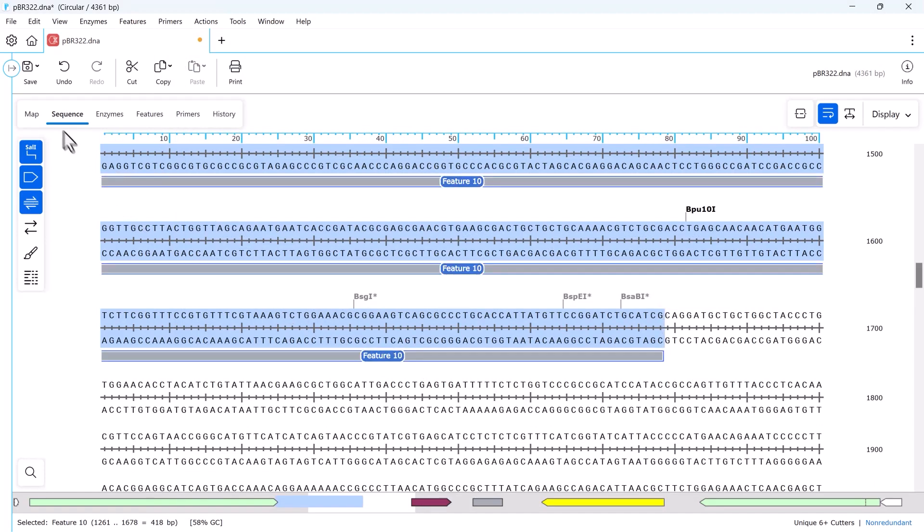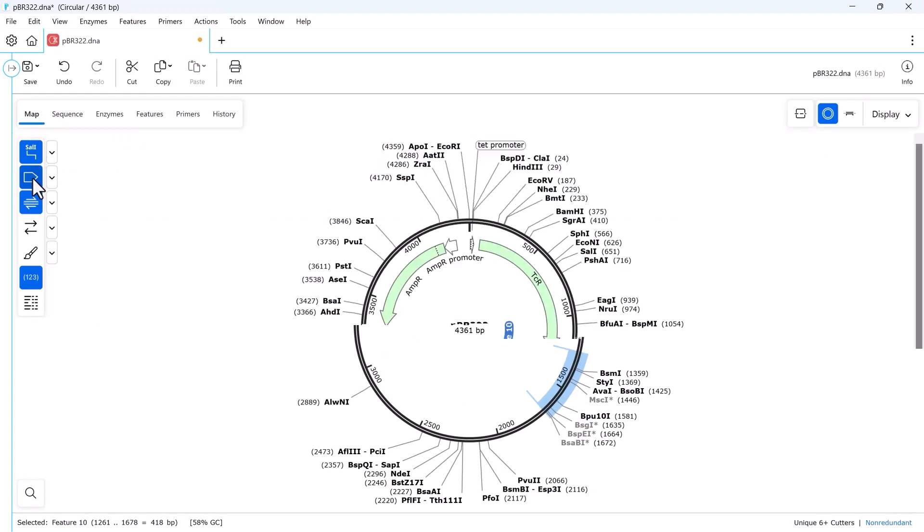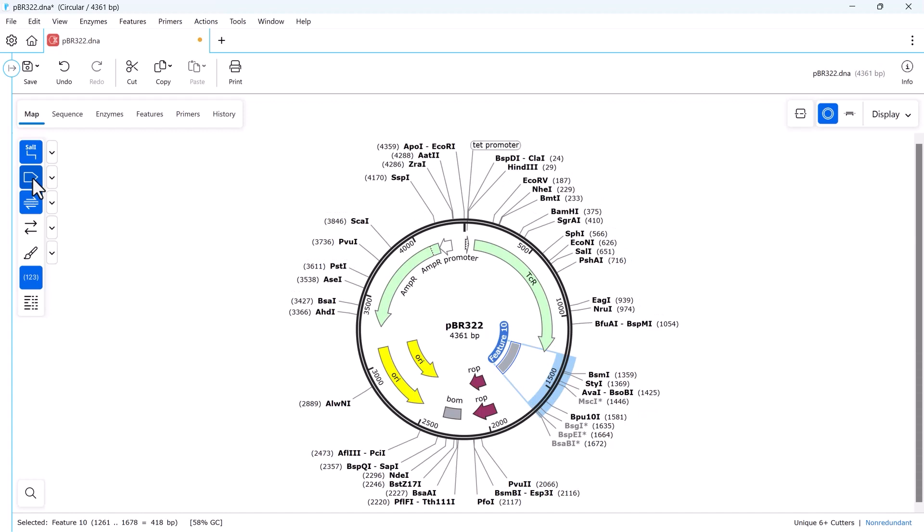As with enzymes, you can quickly toggle features on and off in both map and sequence view.